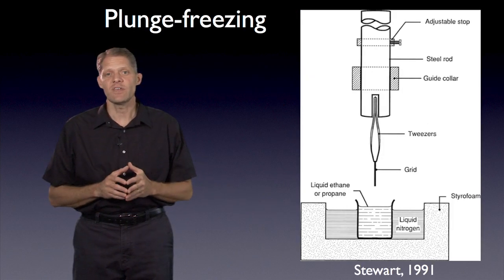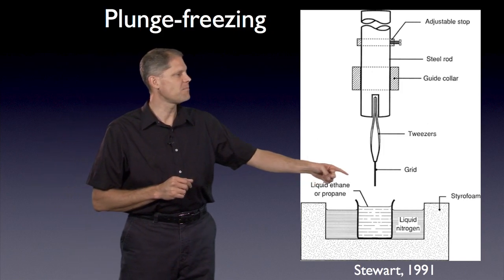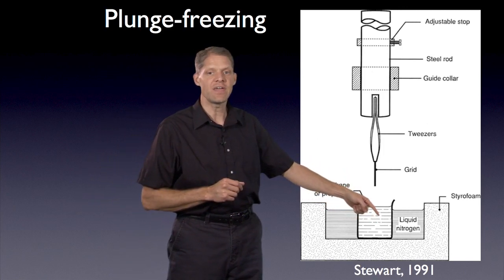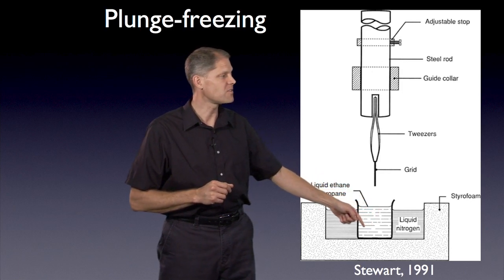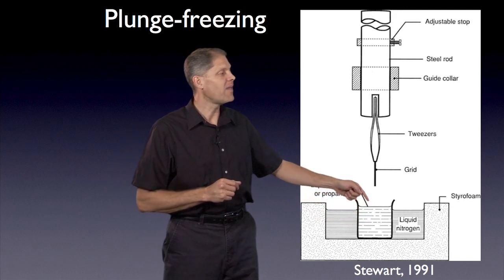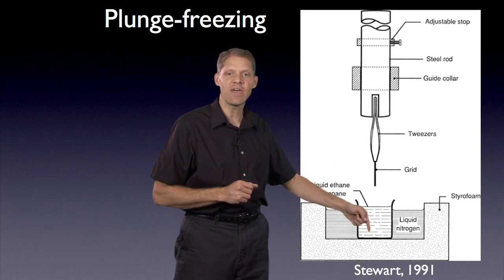In plunge freezing, a very small amount of sample is placed on an EM grid suspended above a reservoir of liquid ethane, typically. And the liquid ethane is cooled by being surrounded by liquid nitrogen. So the ethane is at approximately 80 Kelvin. And then the sample is rapidly plunged into the liquid ethane.